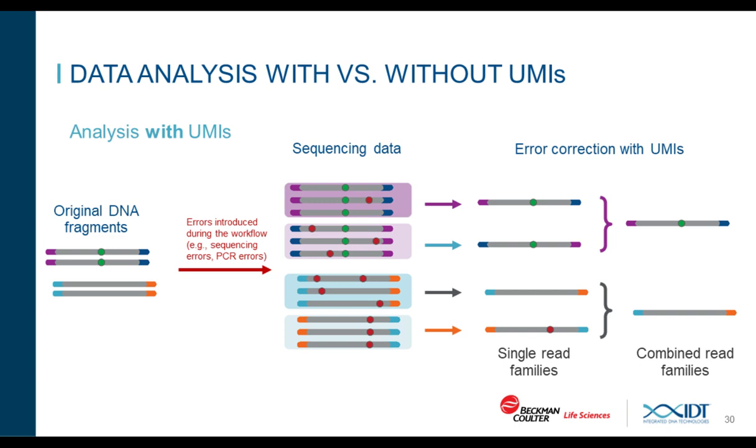And what are the advantages of fixed UMIs over random UMIs? Yes, that's a good question. Fixed UMIs enable strand-specific molecular indexing because they independently tag the top and bottom strands. So even if a PCR or sequencing error does occur within the UMI, it's possible to identify and correct for these errors, preventing artificial library complexity.